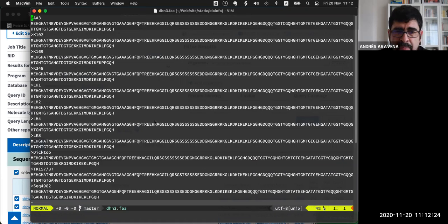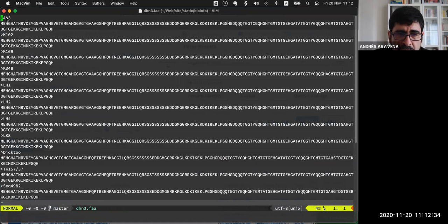We published this paper a couple of years ago, and when she did the research, she invited me when she got the data ready. So here we have this. It's a FASTA, very short names and the sequence. We're going to work with this, not only today, also next class. So keep this file at hand.